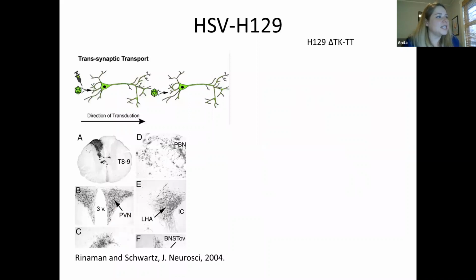Okay, and then I'm just going to talk briefly. I didn't have time to get into detail on how herpes simplex viruses are trafficked and taken up and expressed and all of that, but essentially it travels anterogradely, and this has been known for probably 15 or 20 years. Gary Schwartz in the Department of Medicine at Einstein has a paper where they injected an HRP, I think, in an HSV H129 vector.